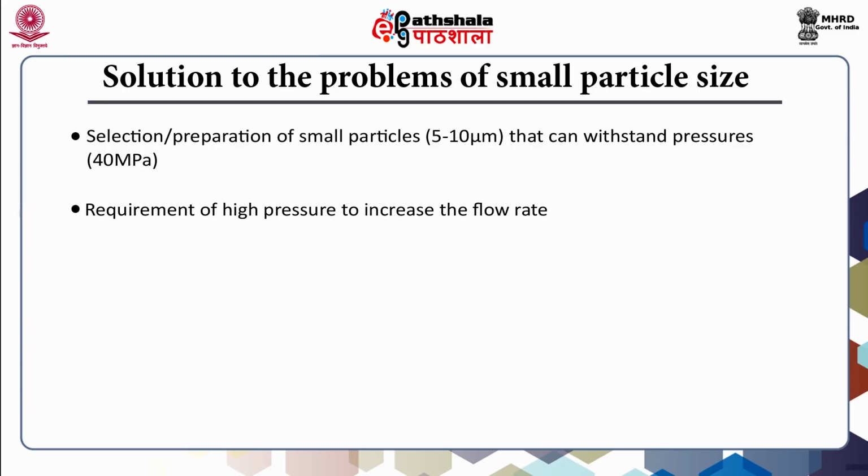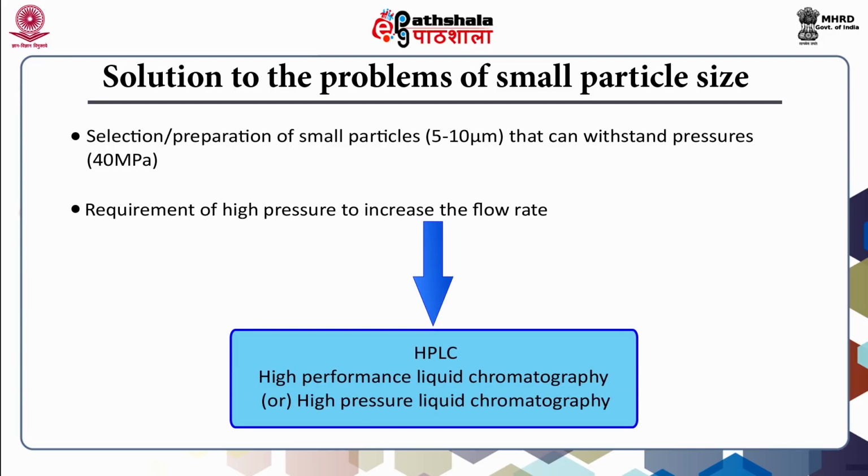As by decreasing the small particle size, we are increasing the performance of chromatography, that is why it is called high performance liquid chromatography, and also we are using high pressure to increase the flow rate, that is why it is called high pressure liquid chromatography.